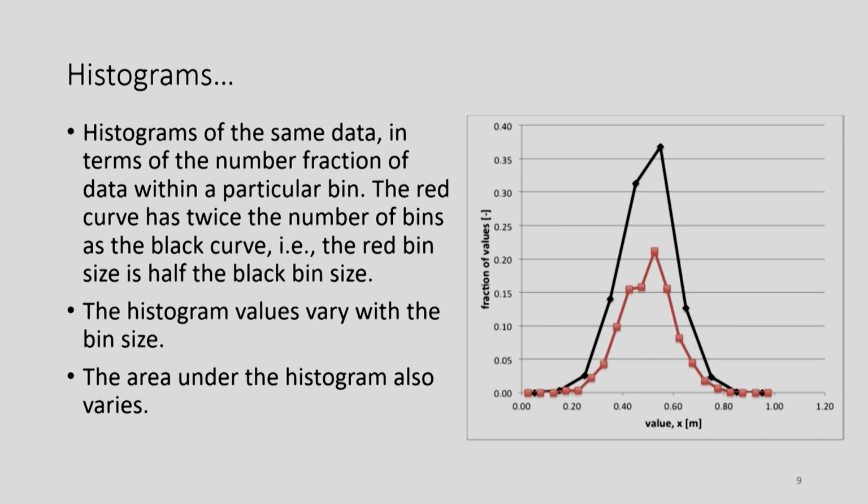So it's an example again, a couple of histograms. One is again a fraction of particles in that size, and it's the same particle size, right? So same powder, but you can see two different distributions, right?